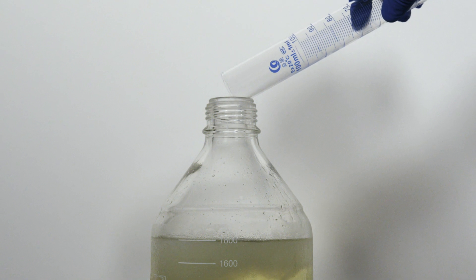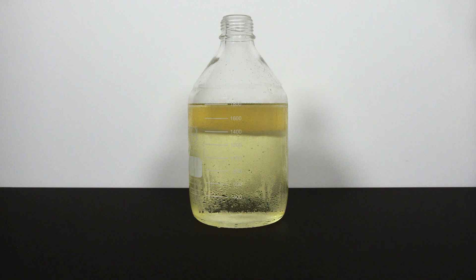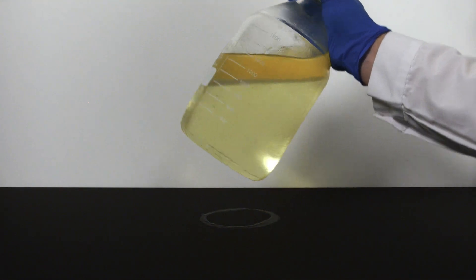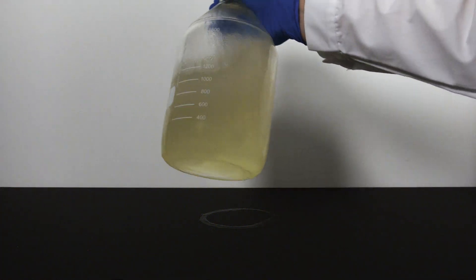I guess everything should still be fine, right? Oh sh**. As you can see, the haloform reaction is very exothermic — acetone starts to boil once it is added to the bleach. This is the perfect demonstration of a runaway reaction, and you should definitely chill the bleach to a colder temperature before adding acetone. Anyway, I still cap it and gently shake it to mix it, place it on the table, and loosen the cap to prevent pressure build-up.